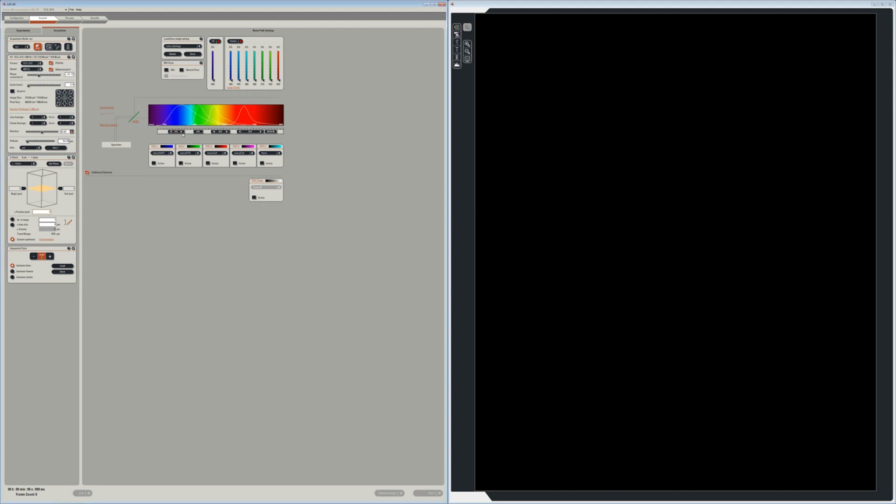And right now the detector is right under the emission curve. You can move it to any place that you want, and you can expand it or shrink it. But I would say around here it's okay.